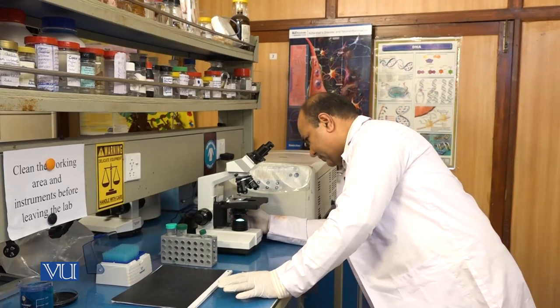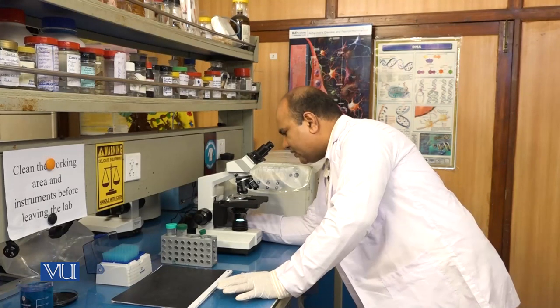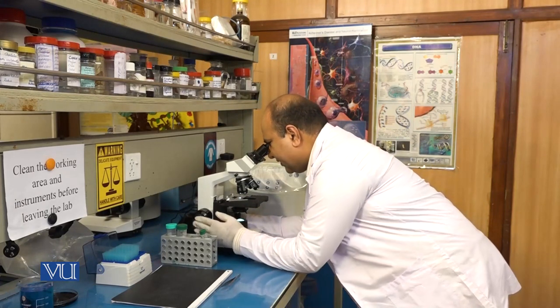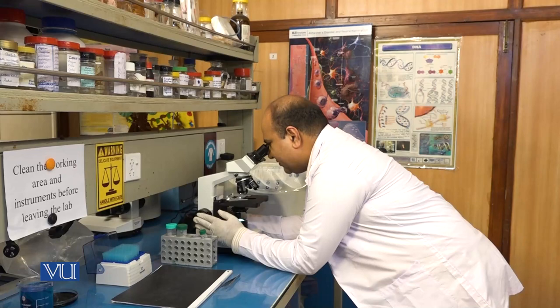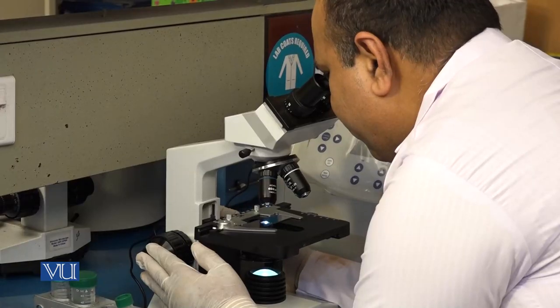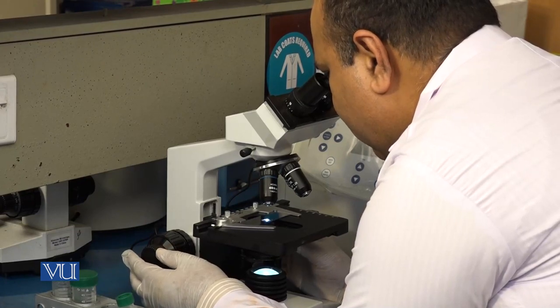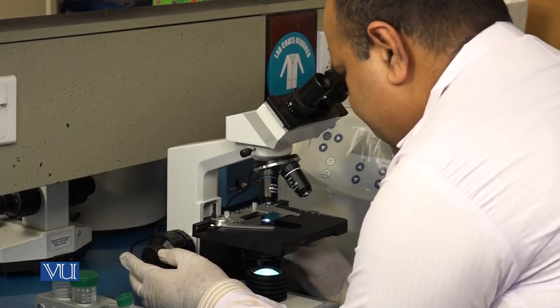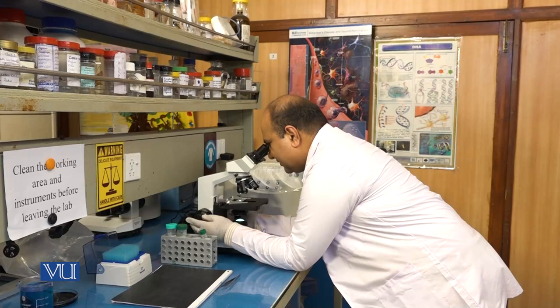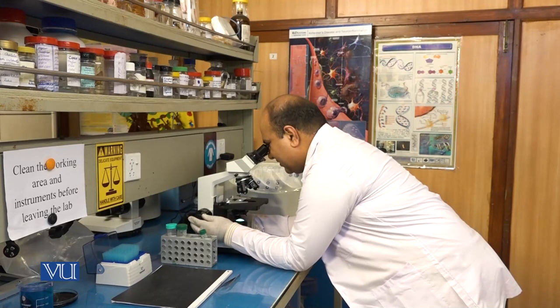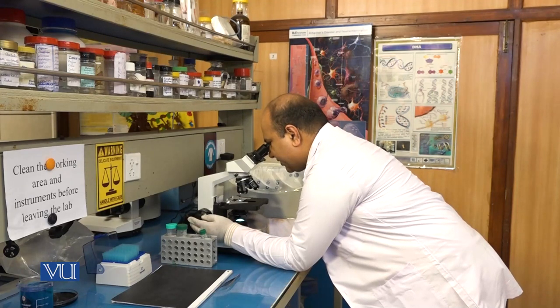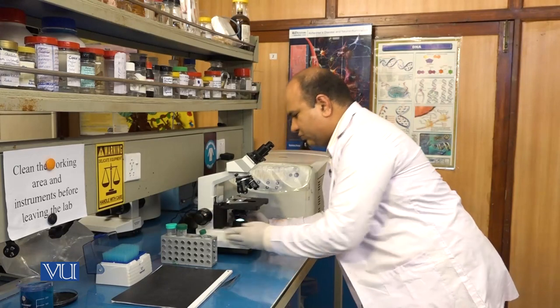Magnification is nothing but the product of magnification of the objective lens and the eyepiece. So yes, now I can see lots and lots of metaphases here. Now let's see these metaphases at higher resolution.